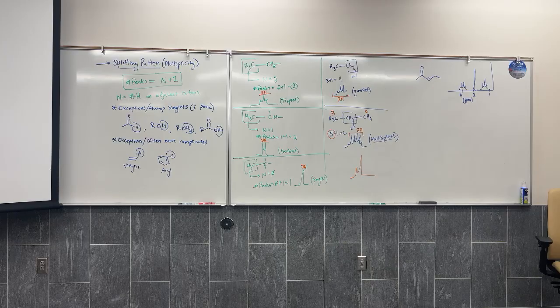Alright, so we got CH2, that's CH2. Great. The only thing that I would change is to put the coefficient in front and call it 2H, 3H, so it doesn't come across as H2 or H3, like a molecule.